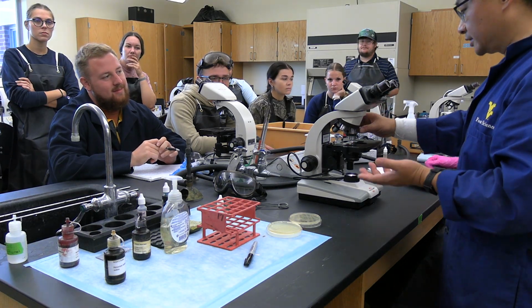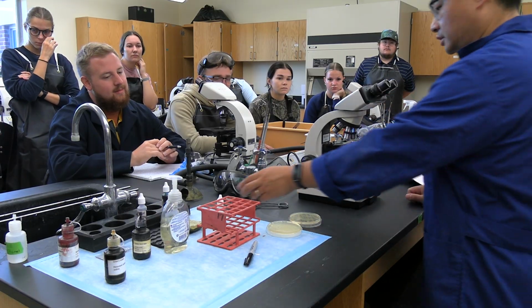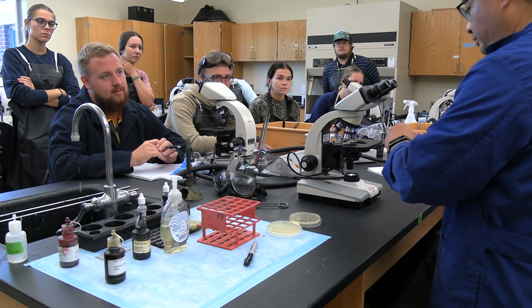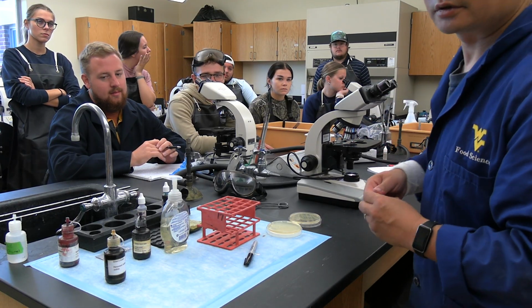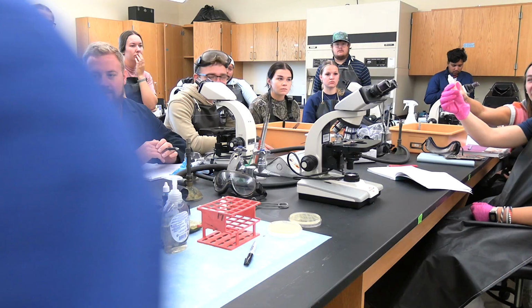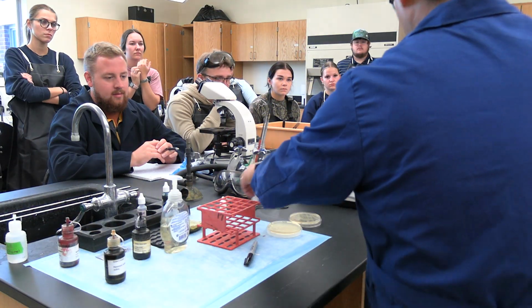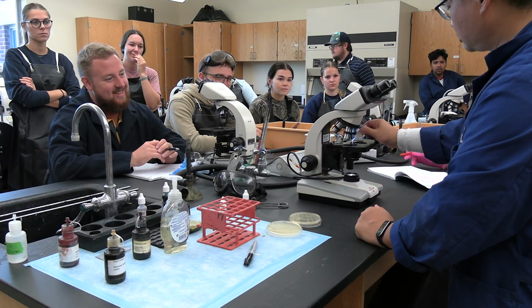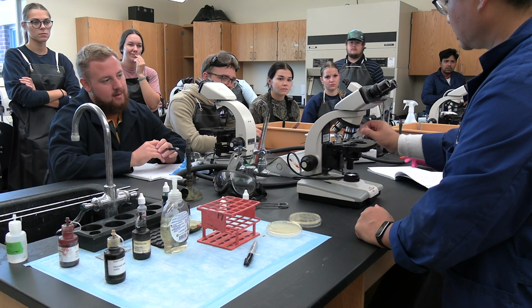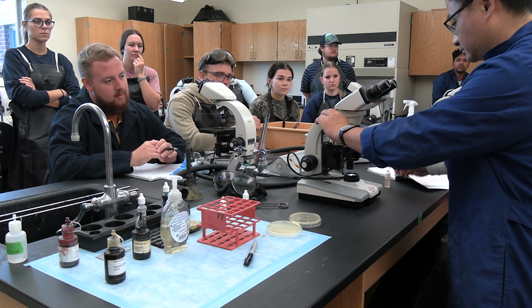That looks fine. Okay, now same thing, we add oil. So one twist, do not use 40x, another twist. Then we're going to add a big drop of the oil. That has to be big. So we add one big drop right here. No oil in this one. The bottle obviously is all on here. Some of them don't have it at all. Okay, maybe that one is good. This one is always good. So we're going to add one drop. We also could add one drop here. Okay, I'll just take advantage to see what it looks like. Sometimes it works very well, sometimes it doesn't work.